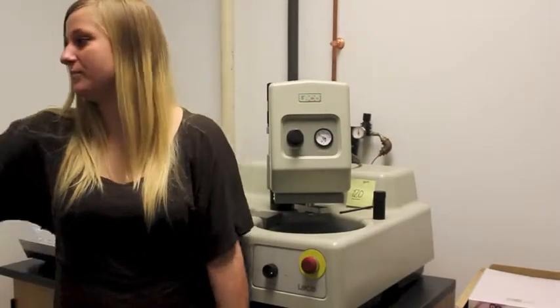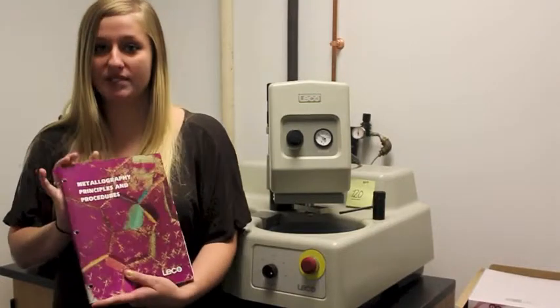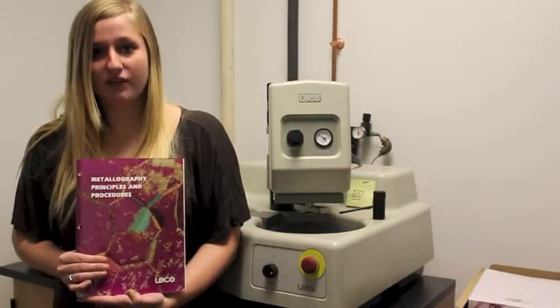In our lab, we have the book Metalography Principles and Procedures, which outlines material-specific suggestions for grinding and polishing. In biomedical engineering, grinding and polishing could be useful for altering the surface characteristics of a biomaterial in order to later study the possible effects when placed in the body.